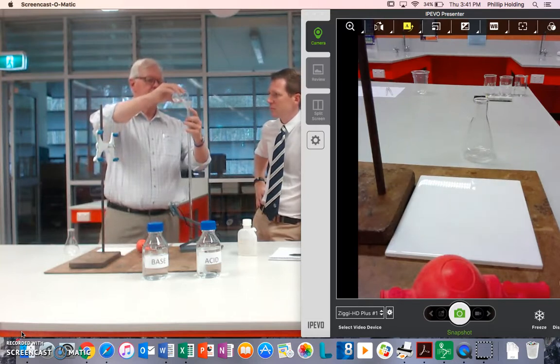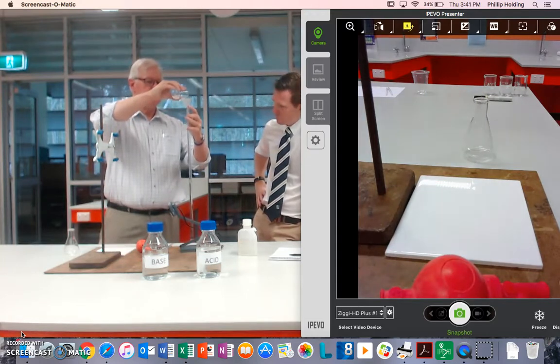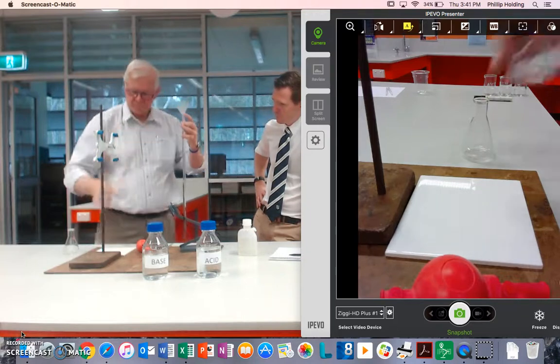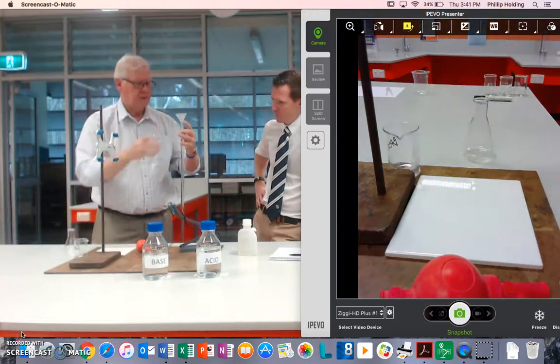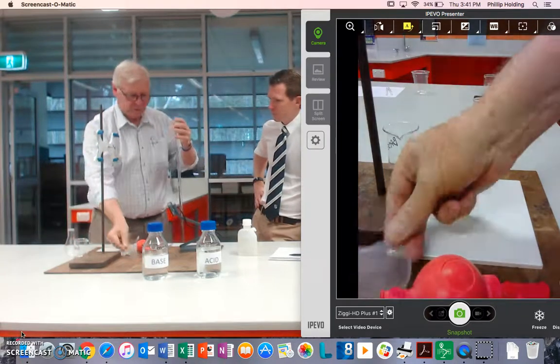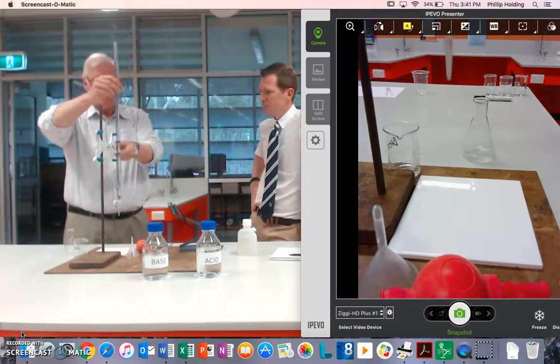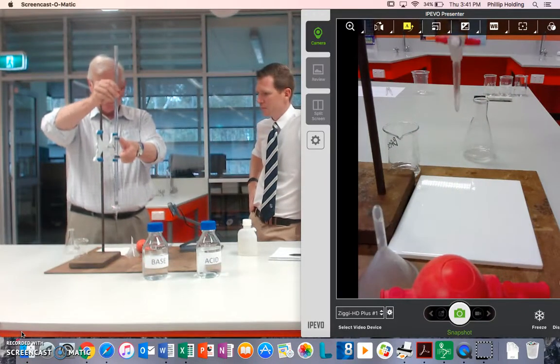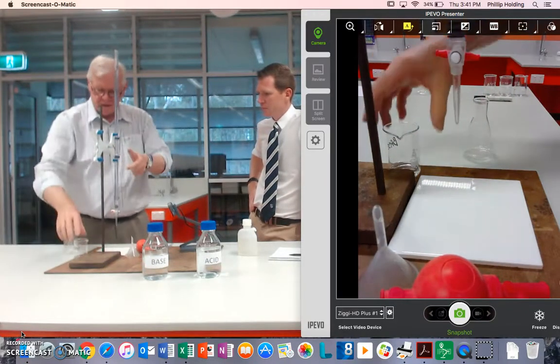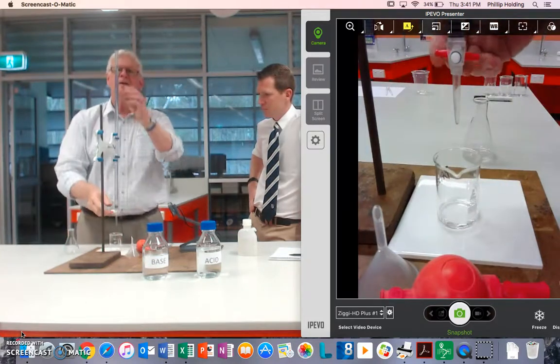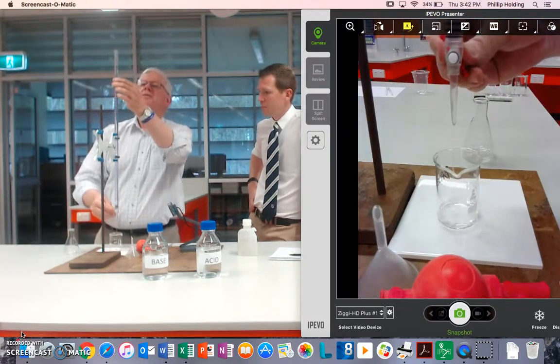Refill. Now, go beyond zero, so overfill. You can see all this happens very quickly. It's easy to transfer. The clamps are very good. And putting my beaker back, I'm now going to bring it down to zero.